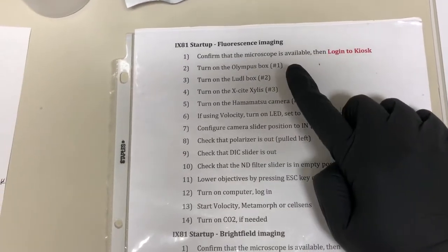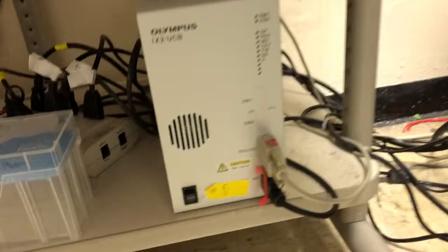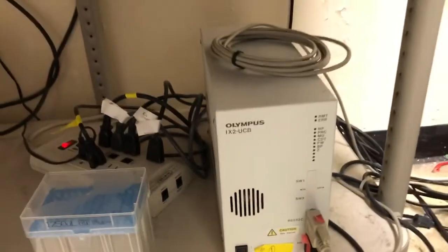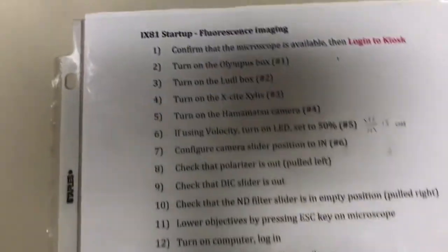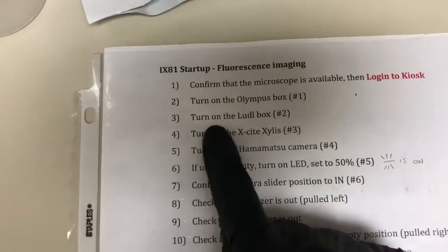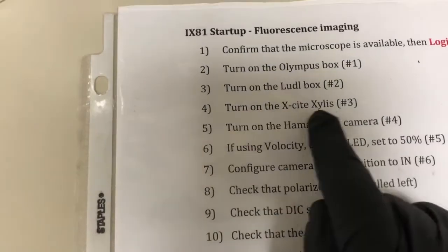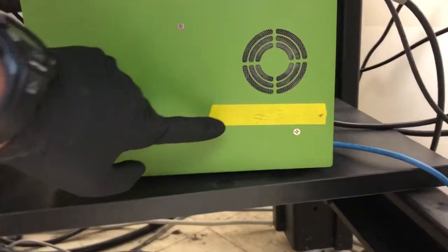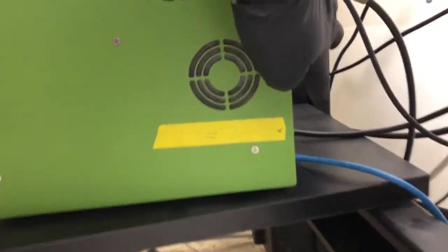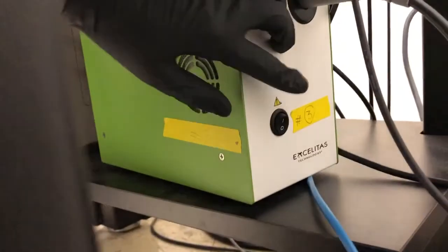The second step is to turn on the Olympus box, which is item number one. The Olympus box is down here. There we go. The lights should turn on and you'll hear a bunch of noises on the microscope. Second step is to turn on the Excite Silas. That's number three. So that's this element here. You can barely see it's a little bit faded. And there's an on-up button over here. Let me see if you can see it on the side. So there's an on-up button.